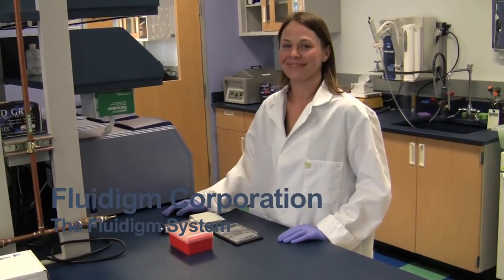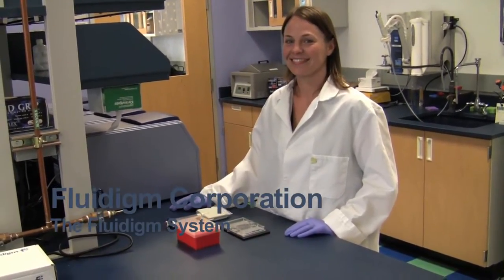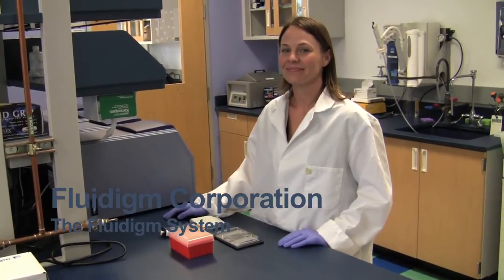Here with me I have Amy Hamilton and we're at Fluidigm Headquarters. Amy, first of all, tell us what you do for the company.